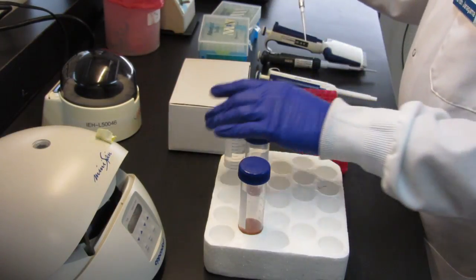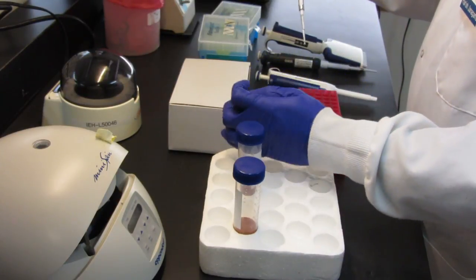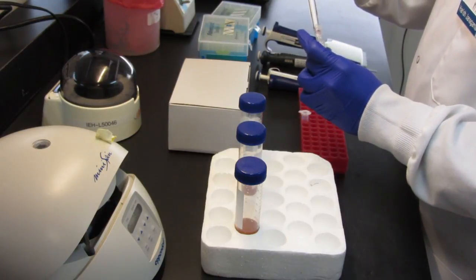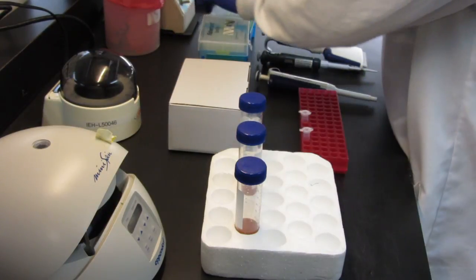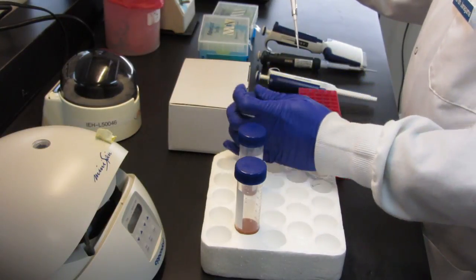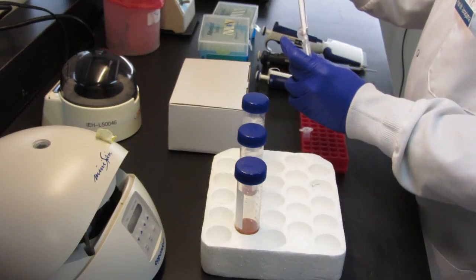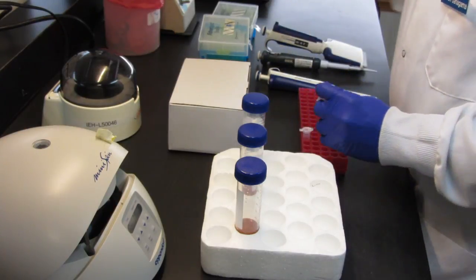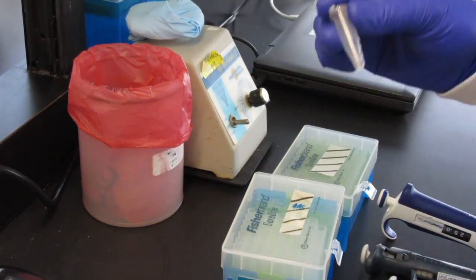You will then carefully resuspend the pellet in 50 microliters of distilled water. Vortex your sample briefly to make sure the pellet is mixed well in the water.